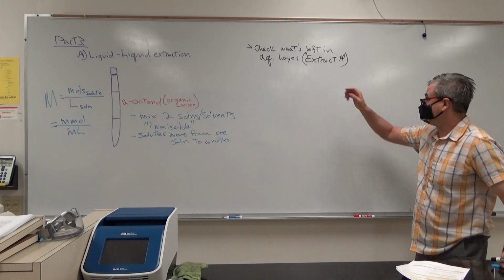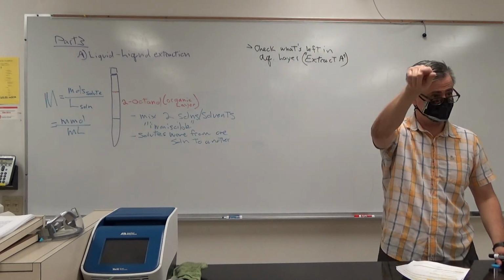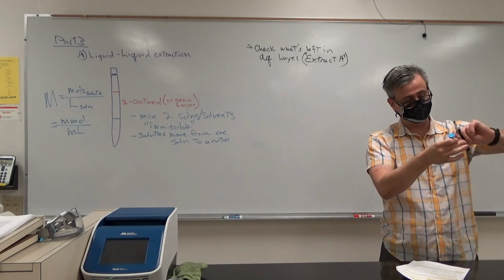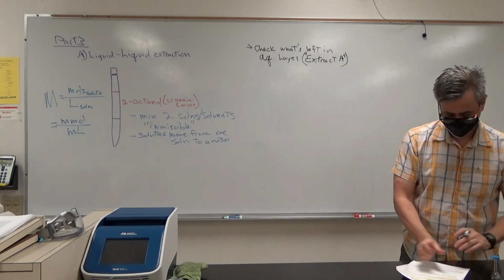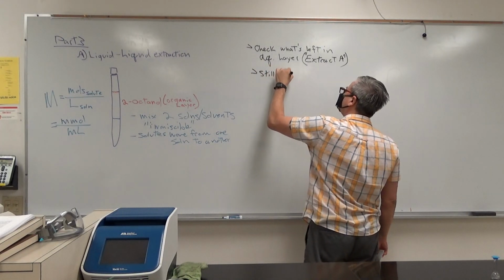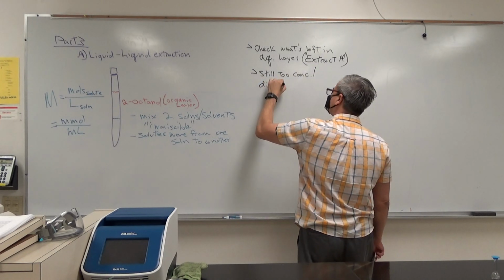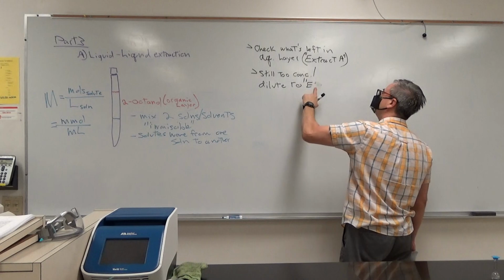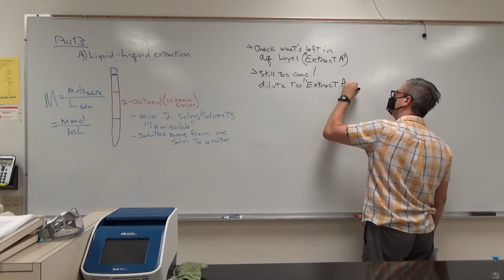But again, extract A, even though we have removed some of the methyl violet, it's still too concentrated to put in these machines. So we're going to do the same trick. We're going to take a volumetric flask. We're going to put in some of extract A. We're going to fill it up to the mark. Still too concentrated. Dilute to extract A diluted.